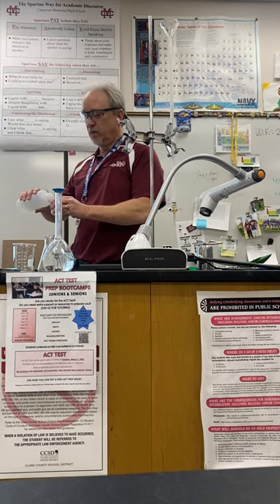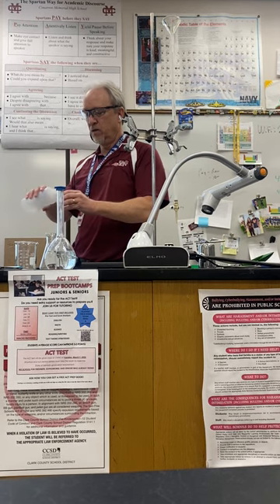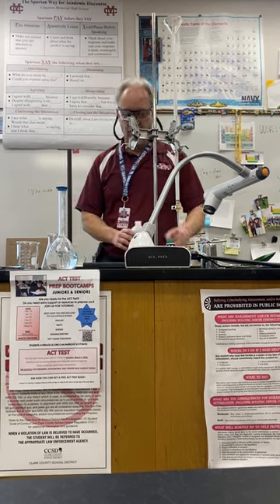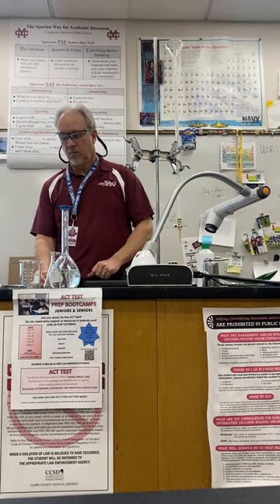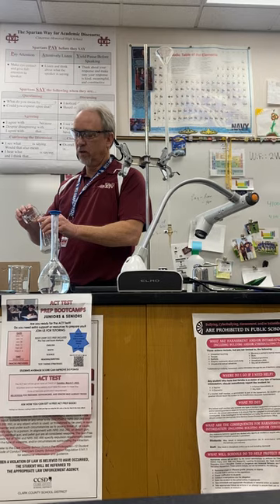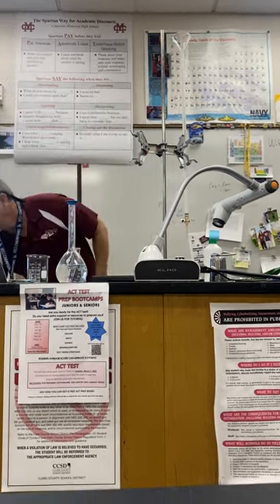So I could take a little bit of my unknown. If I give you this much unknown, you're going to want to take just a little bit of it and pour it into maybe another container. Maybe if I can get another container, I'd pour a little bit in. And then I could do a couple things with it.